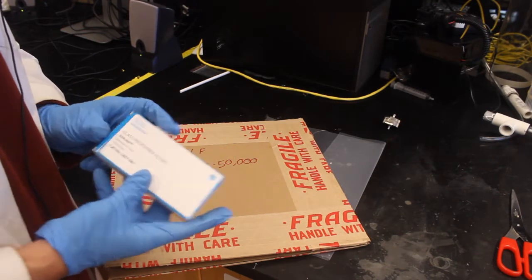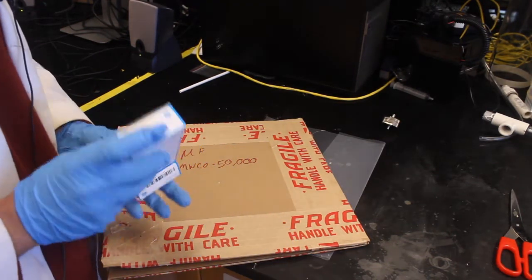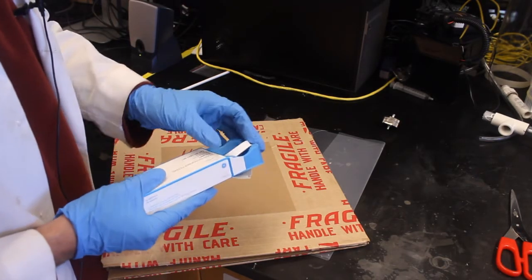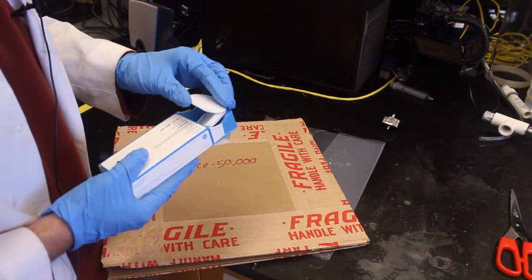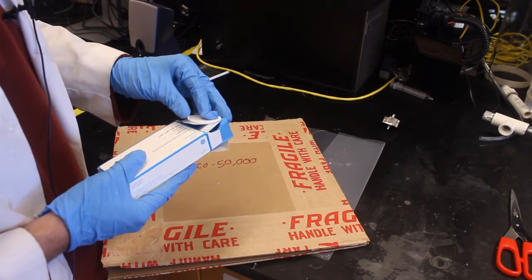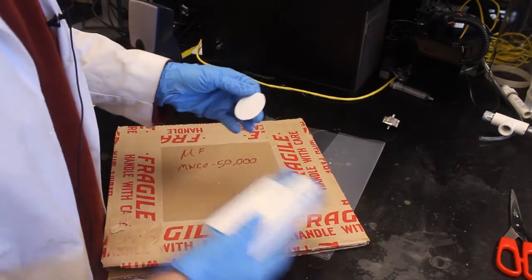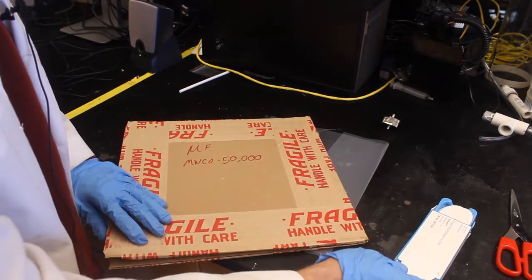First thing we're going to do is grab a Wattman glass microfiber filter. These filters are the size of the membranes that we need. Now these are going to be disposable so we don't have to worry about touching the edges as we're not going to be using these for other testing procedures. So we're going to grab one of those, but we're going to try to be careful to keep the shape. We're just going to set that aside.